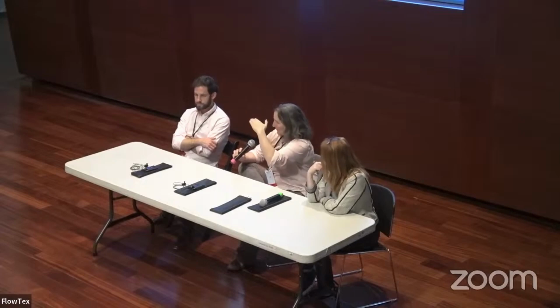So that small amount of fluorescence gets subtracted out as well, but you're still going to get a correct calculation across the board. I don't know that it is actually going to work quite as well for spectral unmixing, but it's valid. Yeah, so I don't think dim versus bright is really going to make that much difference.